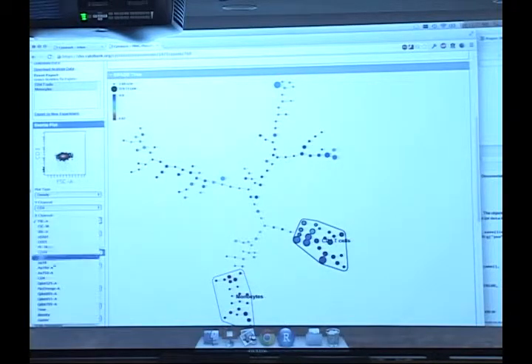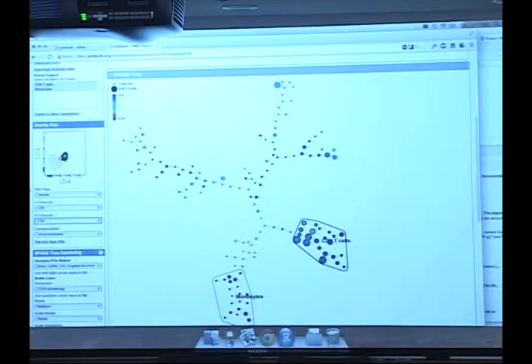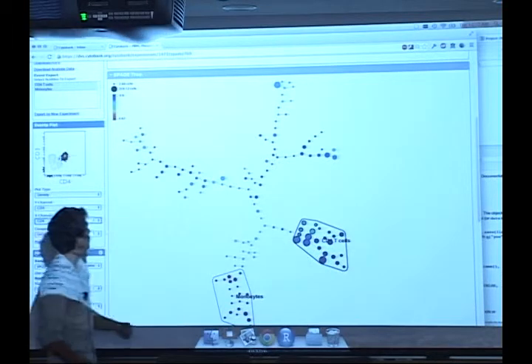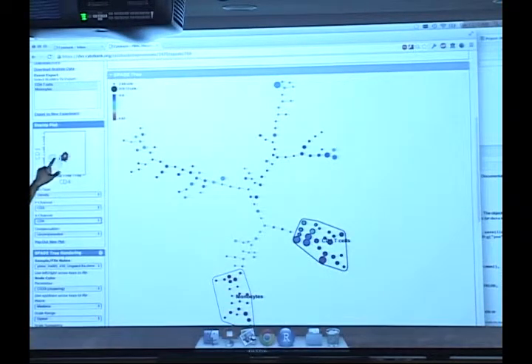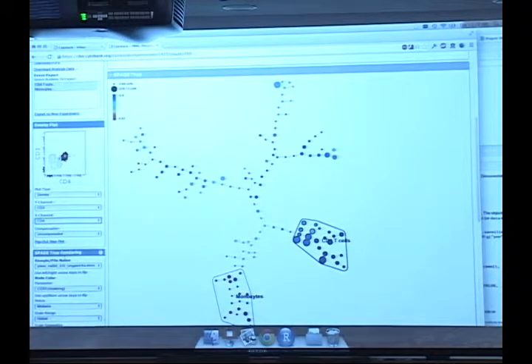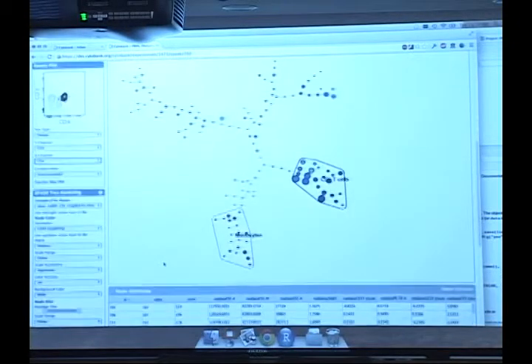So if I plot CD3 by CD4, what this plot shows you is the scatter plot of all the cells that are selected in these nodes. And in gray, in these little gray background contour lines, those are all the other cells. So I can see that this CD4 T cell population that I've defined has high levels of CD4 and high levels of CD3. It's just another way for you to confirm that what you've selected makes sense and is rational. So that's one way to annotate things.